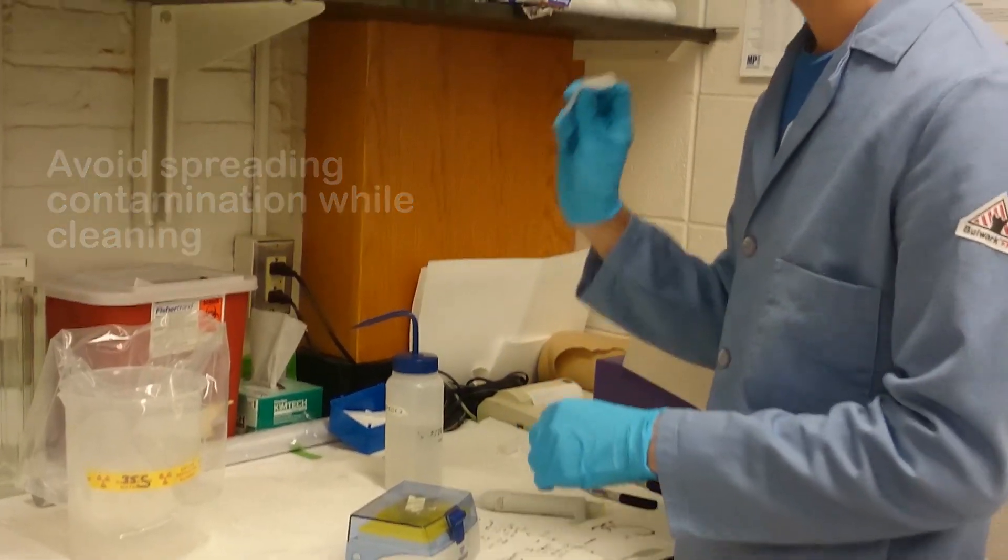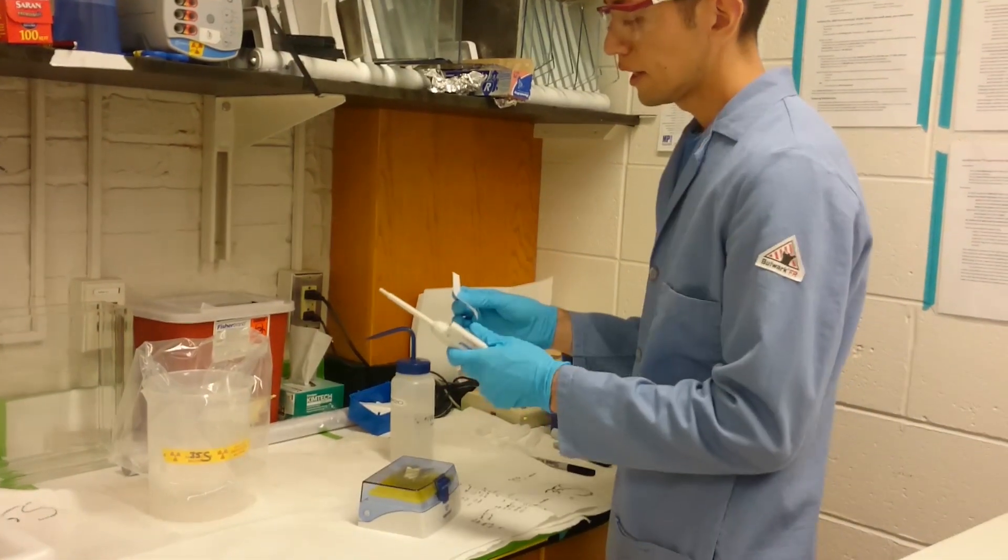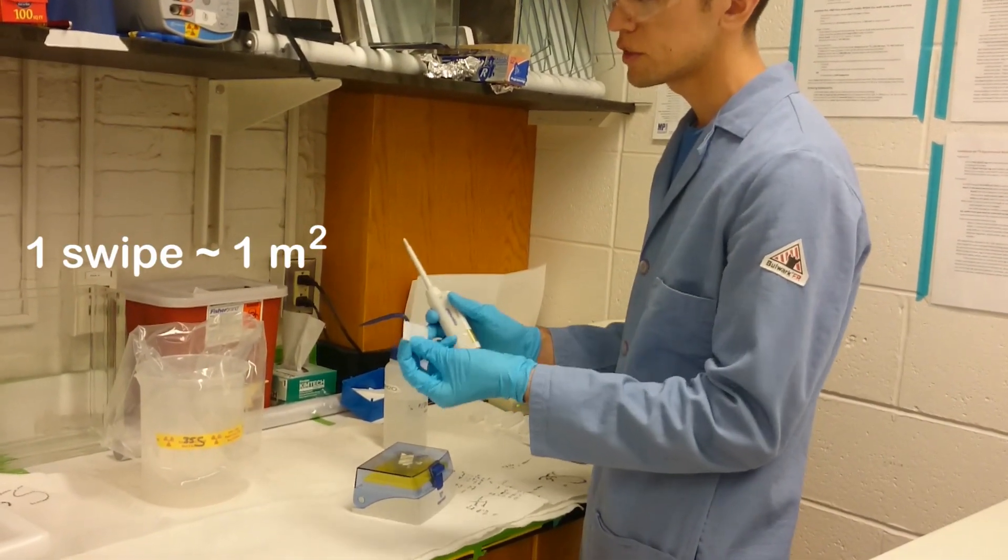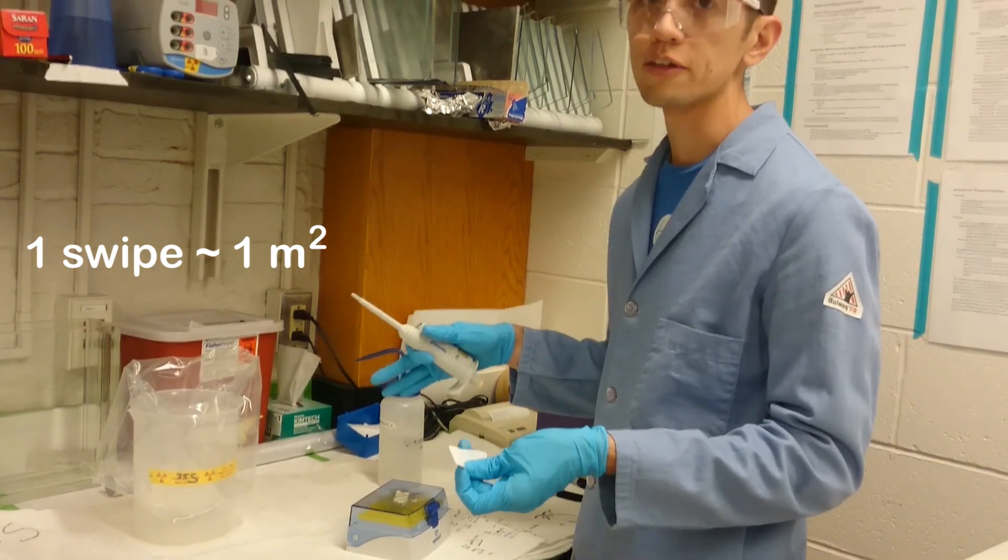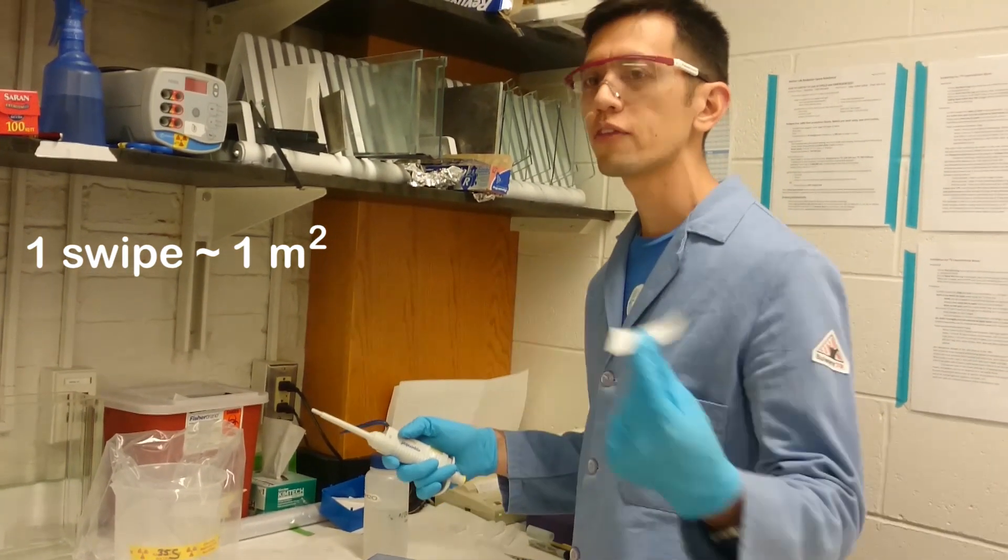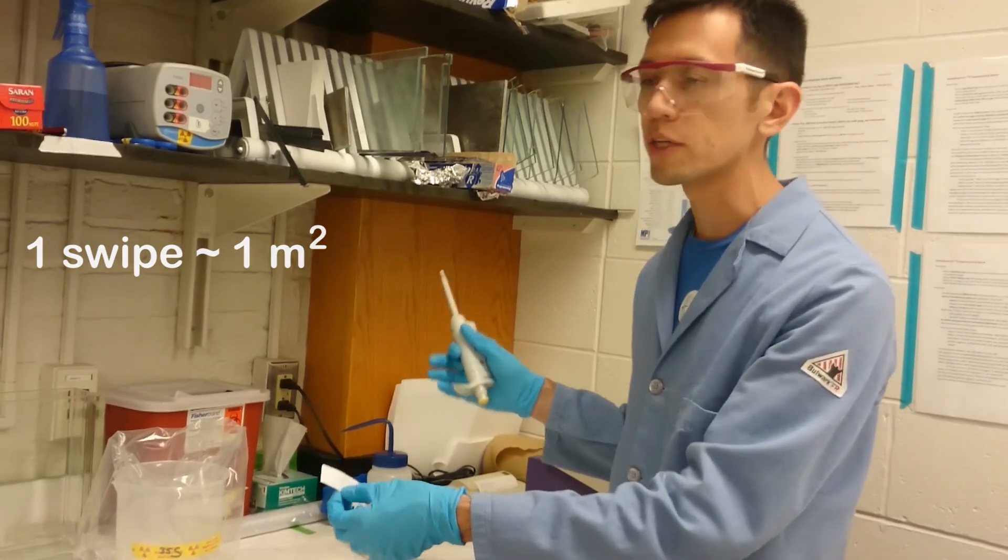In terms of how much a particular swipe can handle, the general rule of thumb is that one swipe can cover one square meter of surface area. So you can't use one swipe to check everything on your workbench.